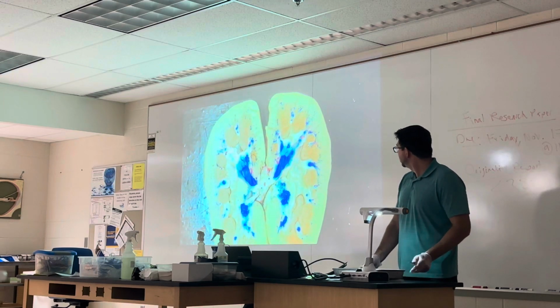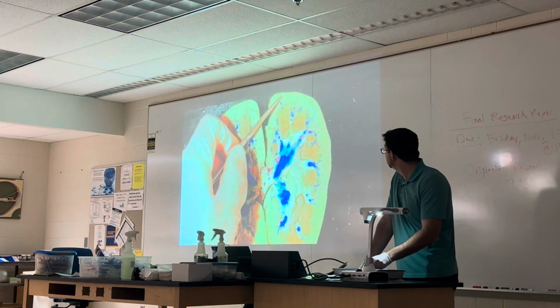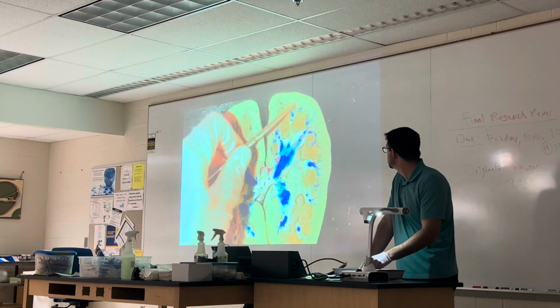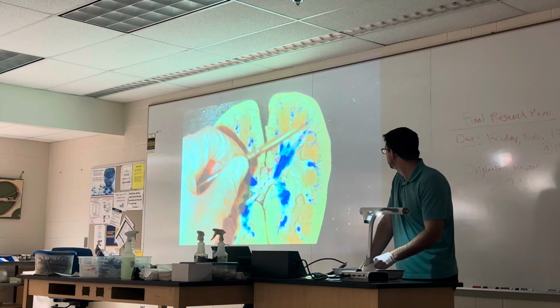Okay, so we'll start right here. What I'm pointing to is the outer region of the kidney, and so this is your renal cortex. This is the renal cortex right here. If we go more internally, right here, this region is your renal medulla. So renal medulla.